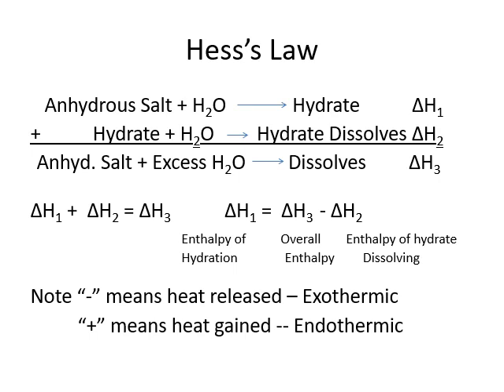So the reactions that we're going to be measuring are taking a hydrated compound, adding lots of excess water, dissolving that hydrated compound. That allows us to calculate the delta H2. We can also take an anhydrous salt, in this case magnesium sulfate, add lots of excess water, and dissolve that anhydrous salt. That would help us calculate delta H3, and that's also a very easy reaction to do. Using those 2 delta H's, it allows us to calculate the enthalpy of hydration.